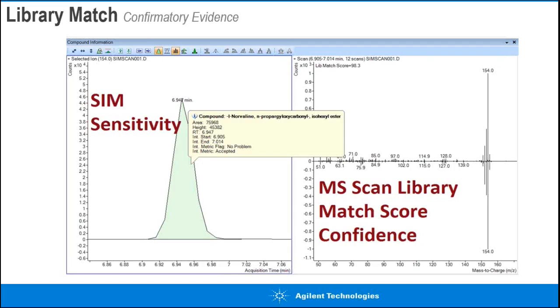Well, one approach that does work well with GCMSDs is the SimScan. So SimScan, which I believe with Target you need to run 2 different injections. With one injection you can do both the sim and the scan, and you don't really sacrifice much on the sensitivity.